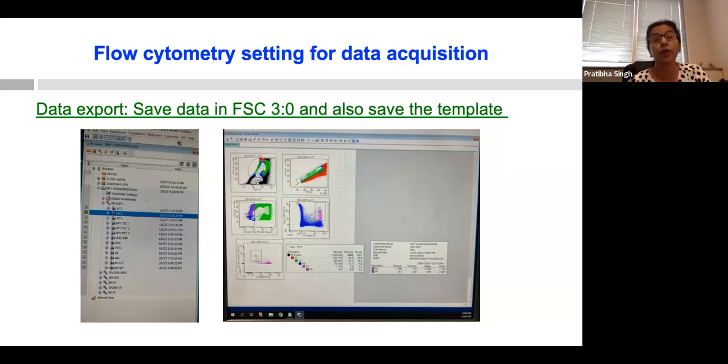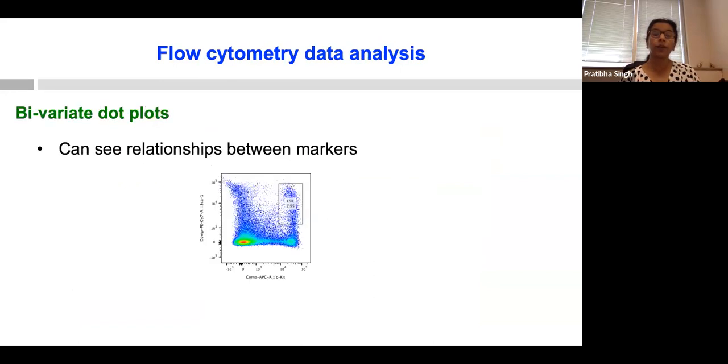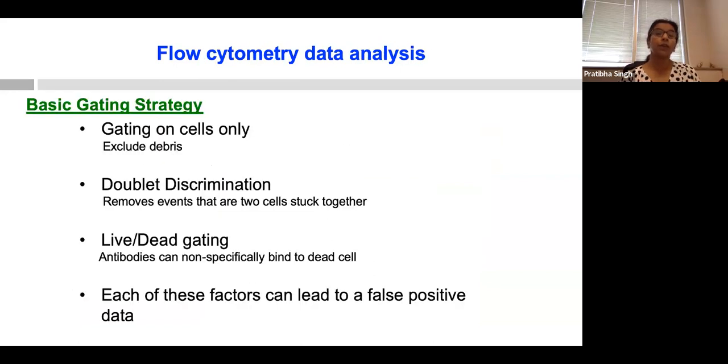You want to get just the cells, not the debris or the bone parts. So that's very important to pay attention to when you are gating.